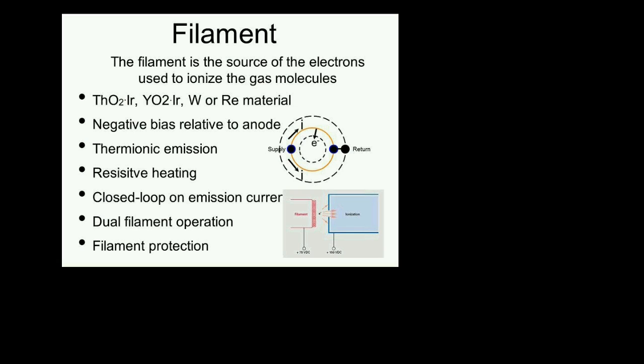You've got to look at what your workflow is. Am I sure I'm never going to overpressure this system? Do I have good control of my air inrush into the system and so on? Do I have good interlocks? If you don't, definitely go to yttria, unless, of course, you have chemicals that can react with this. And if you go online, you're going to find there are several articles on these. There is a good article on the SRS website on this as well.